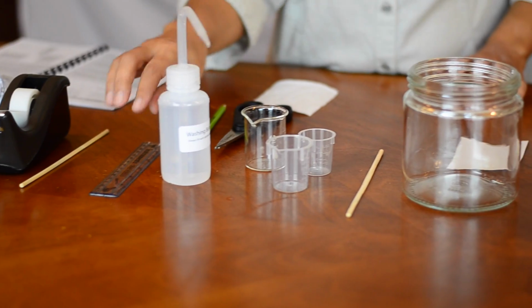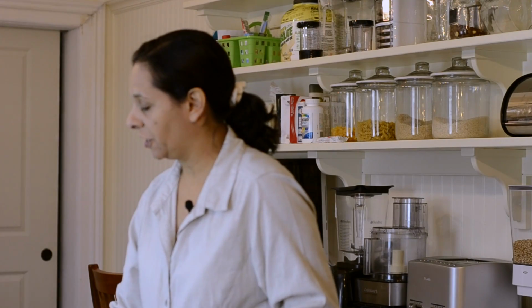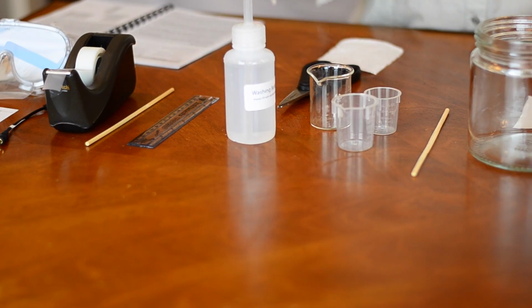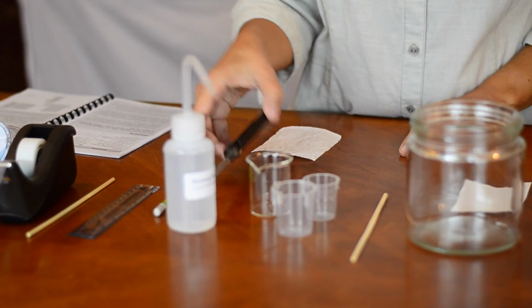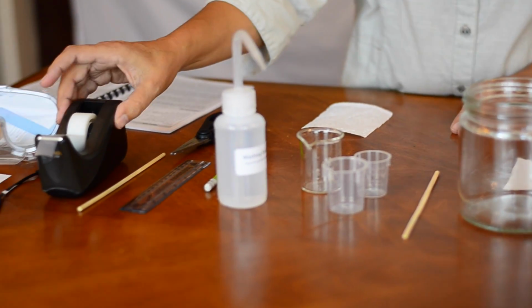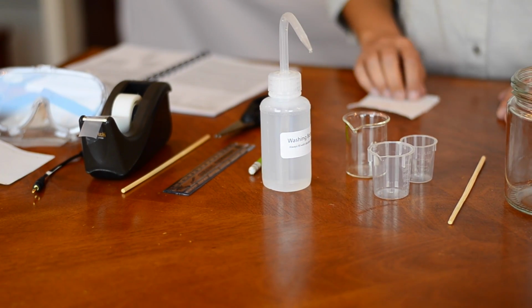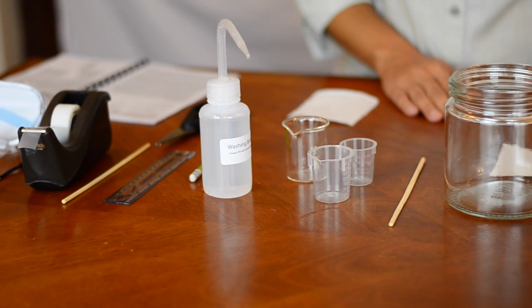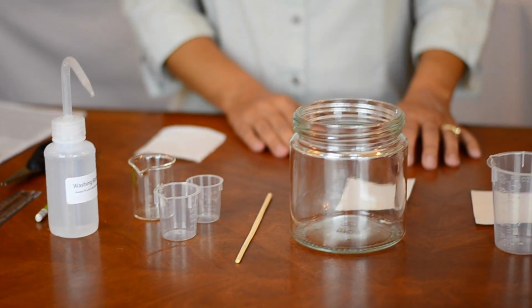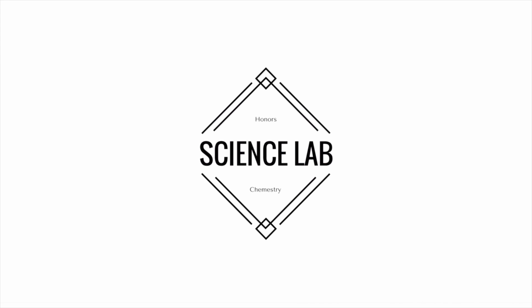And then of course we're going to need a ruler to take some measurements when we're done, a pencil to make some markings on our paper, and then some extra things like scissors and tape. You can also use a stapler to fasten your paper, whatever you find easier. Okay, so if you think you have everything ready to roll, we can go ahead into the procedure now.